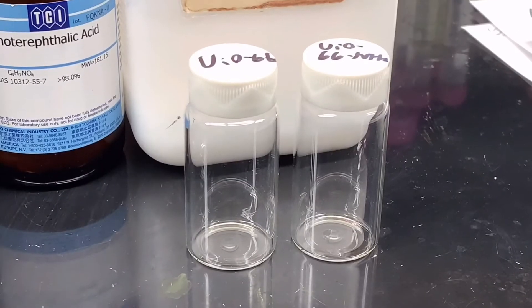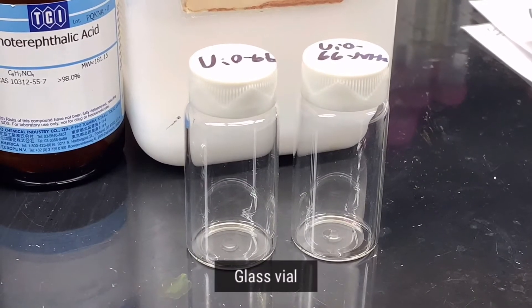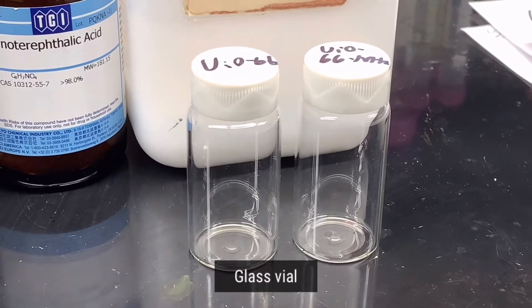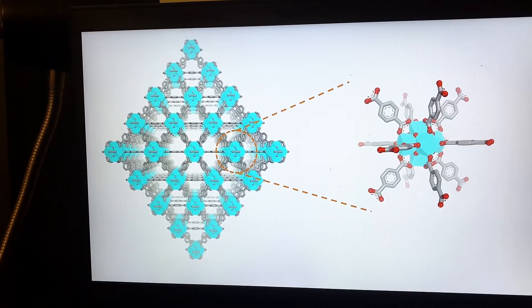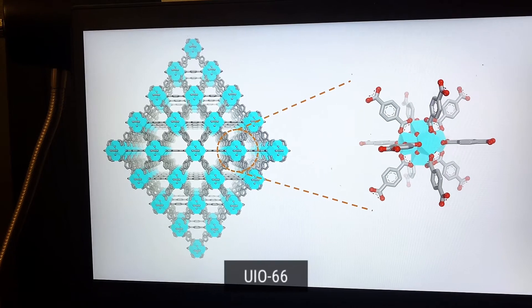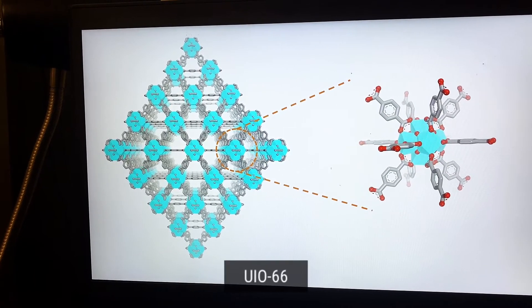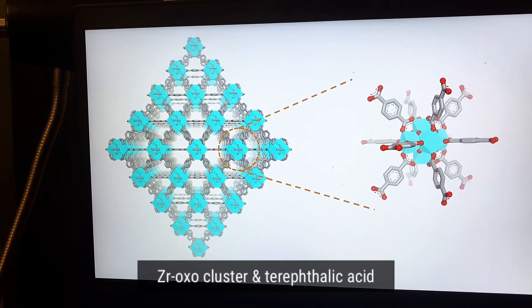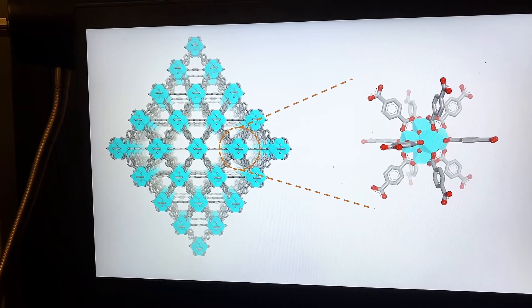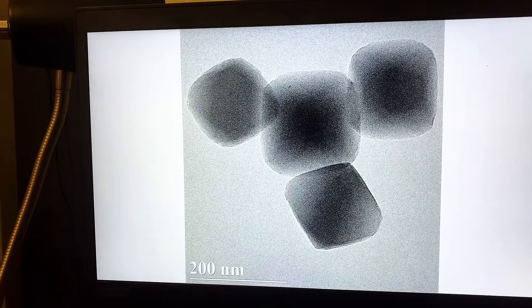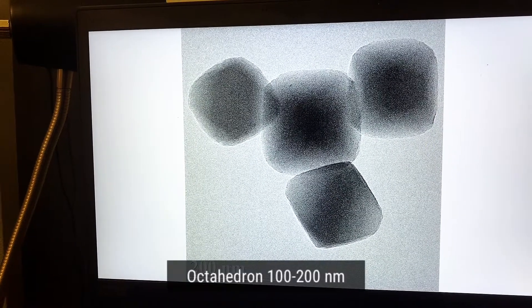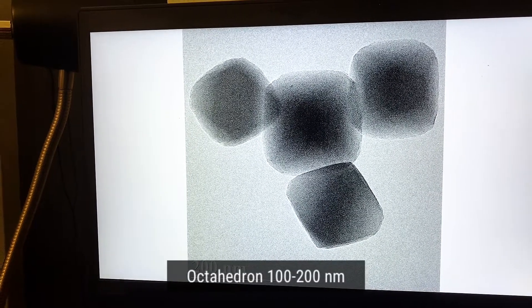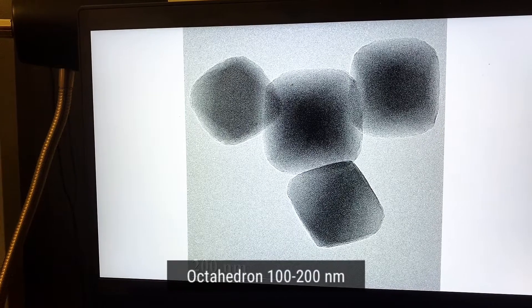We will use benzoic acid as our modulator, and the reaction can be finished in a 20 milliliter glass vial. This is the structure of the UiO-66. It is comprised of a zirconium cluster and terephthalic acid ligand. With this method, we will get UiO-66 with a size between 100 and 200 nanometers.